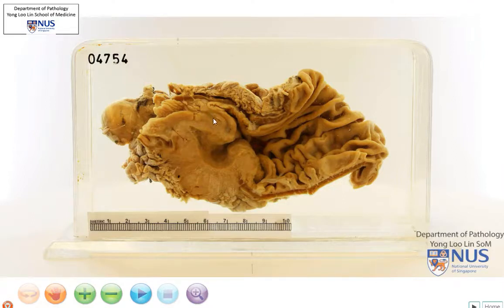This is a pathology specimen of a stomach. Here is the lesser curve and the greater curve. There is a very large fleshy antral ulcer.